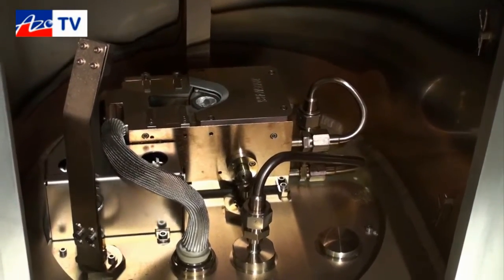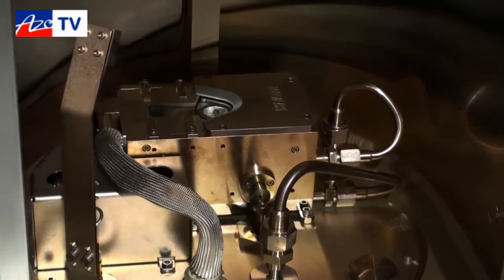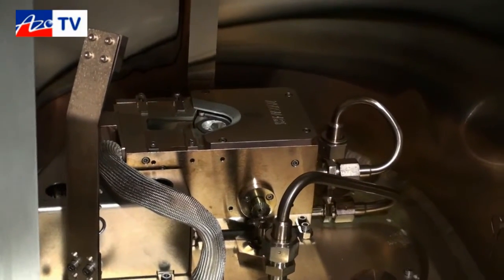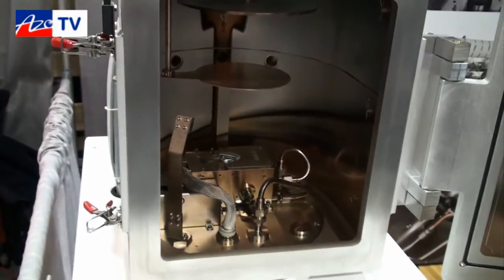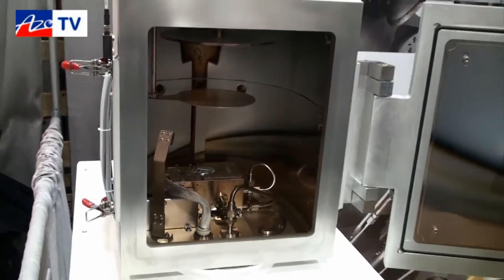We also have a lot of new and inexperienced users using the tools. A lot of grad students that are new to vacuum end up using this equipment, so we make safety a priority.